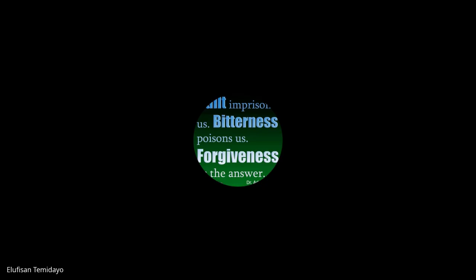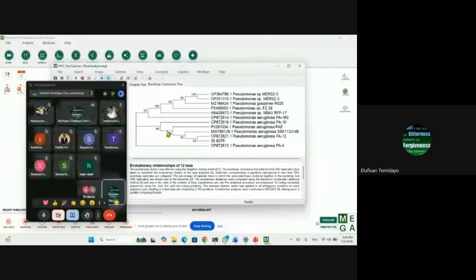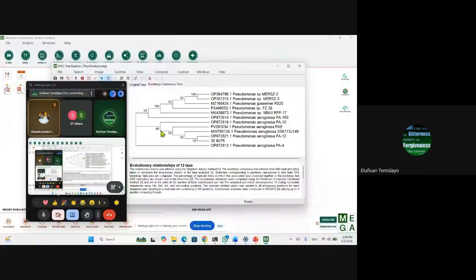Let me see if I still have the tree. I have the tree drawn now. Okay, can you see my screen? Sorry, I stopped sharing. Just a moment, please. It is not present. Okay, wait, I'm coming. Can we see my screen now? Yes, sir.